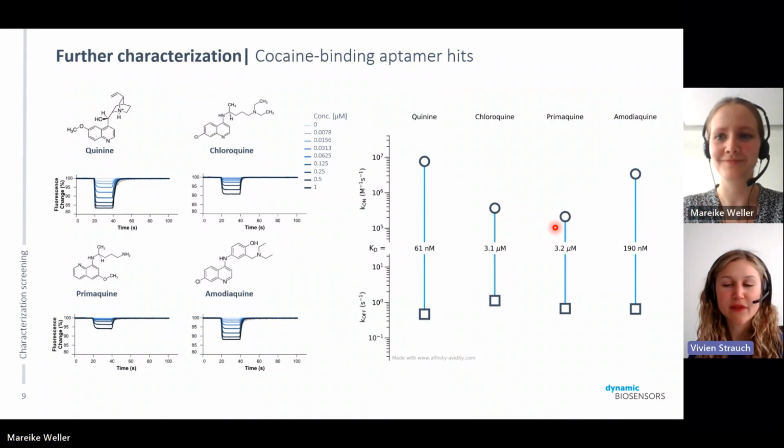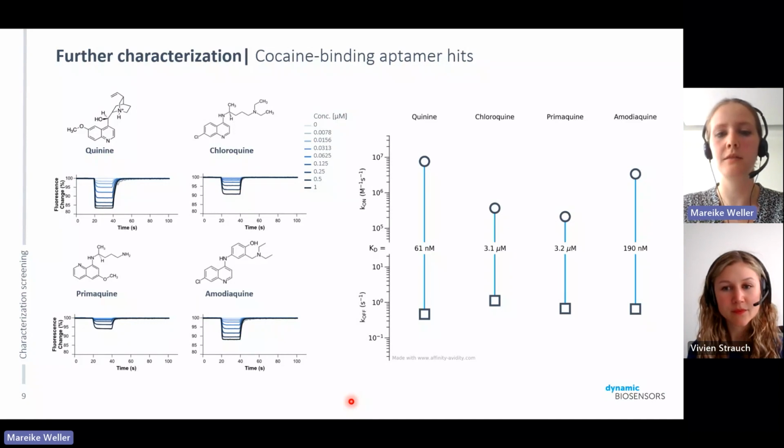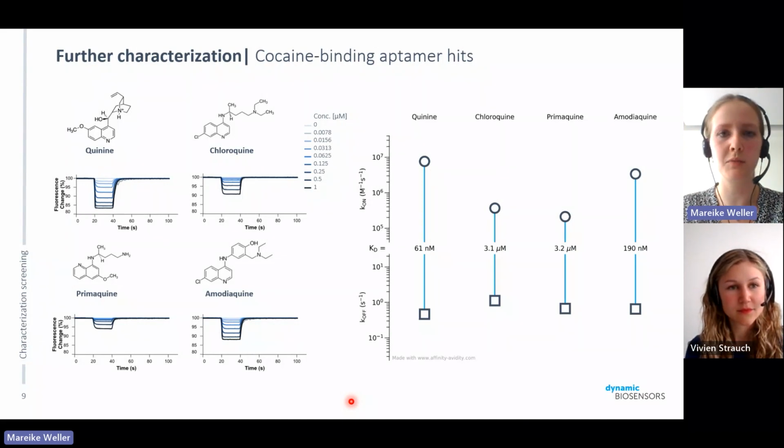But if they are hardly soluble in water, we could also use other buffers, right? Yes, some of them we dissolve in DMSO, for example, and this depends a little bit, but usually for screening, you dissolve them all in some organic solvent and then you dilute them, and a part of it stays in solution usually. So this is the first try I would go with.